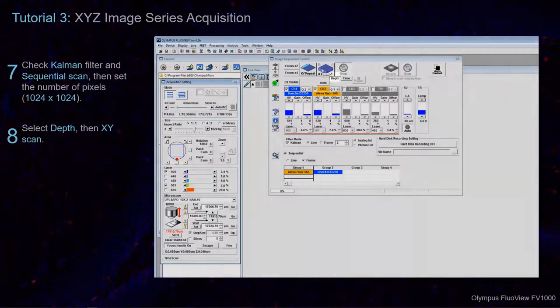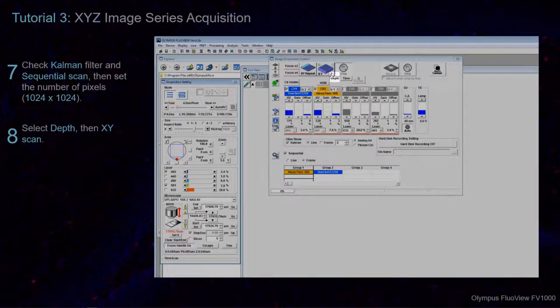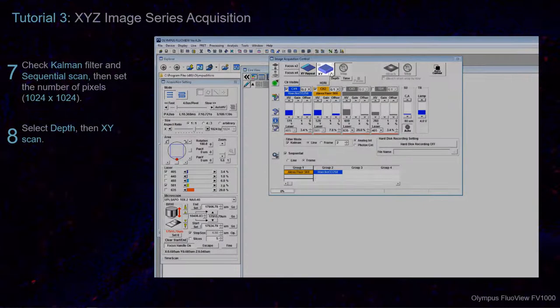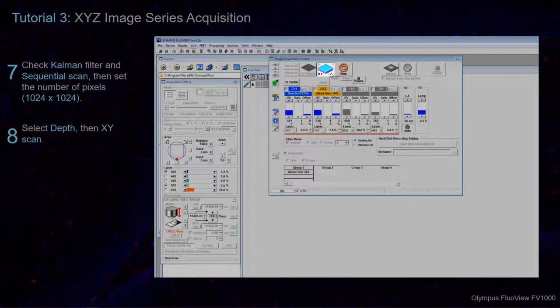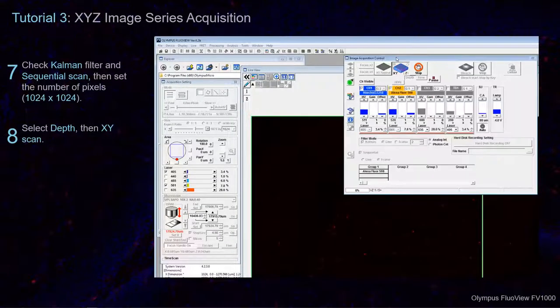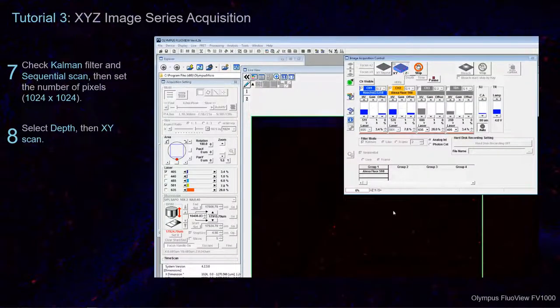If it is not already selected, click Depth and notice that the Z populates on the XY Scan button. When you click this, the acquisition of the image series will begin.